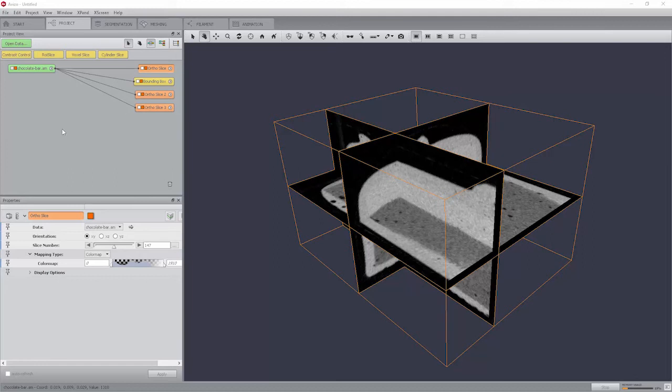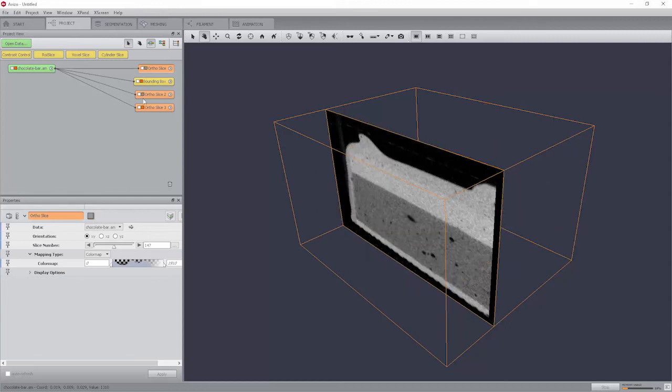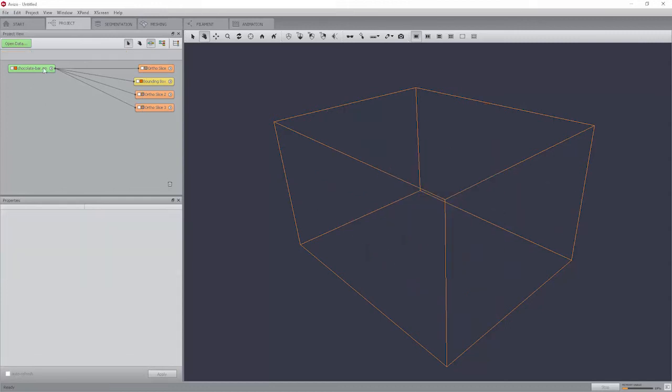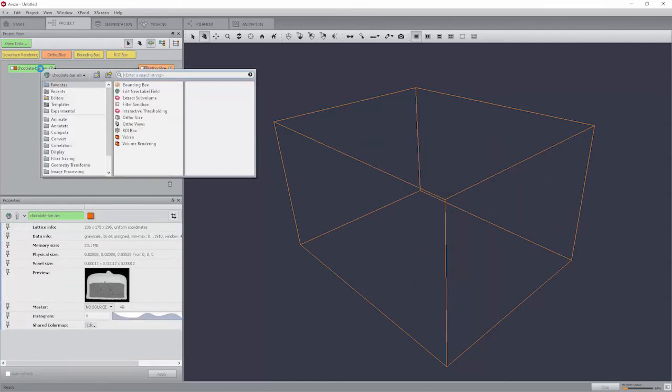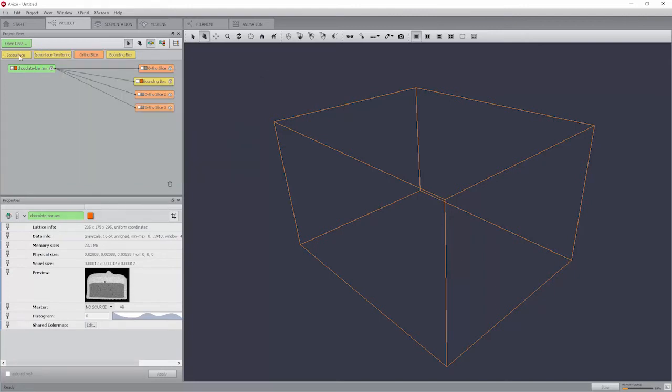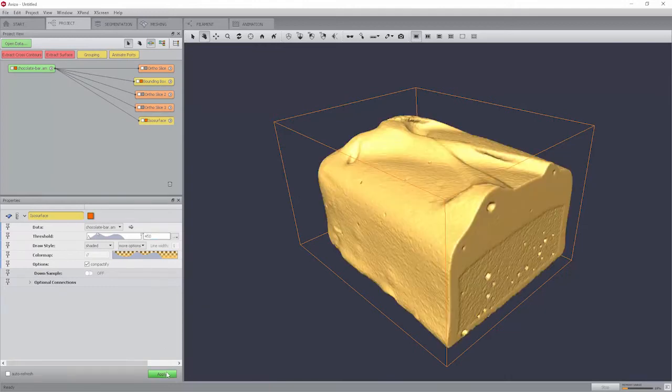Turn off the viewer toggle of the ortho slice modules. Connect an ISO surface module to the data record and select it. Adjust the threshold to 450 or a similar value. Press the Apply button.